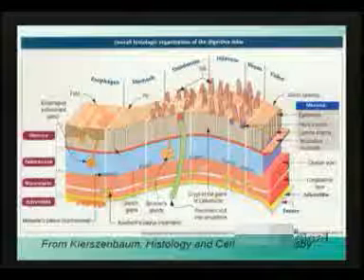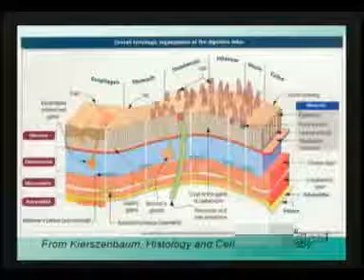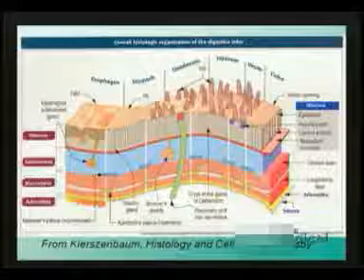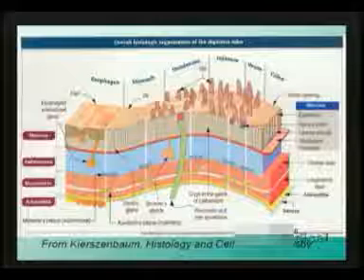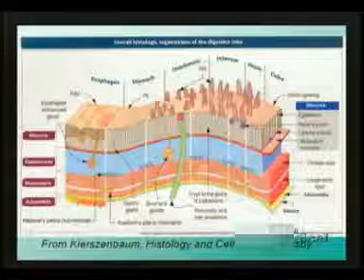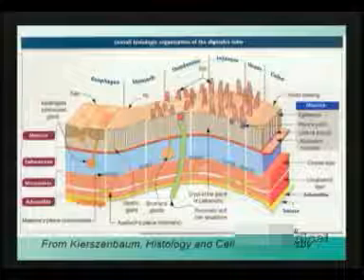In the duodenum, we'll be able to distinguish a duodenum section not by its epithelial and underlying lamina propria characteristics, because all parts of the large and small intestine not only have a simple columnar epithelium, but as you can see, all parts of the small and large intestine are characterized by the pronounced invaginations known as crypts of Lieberkühn. They're labeled on this particular diagram, as illustrated by those white lines projecting down deeply into the lamina propria.